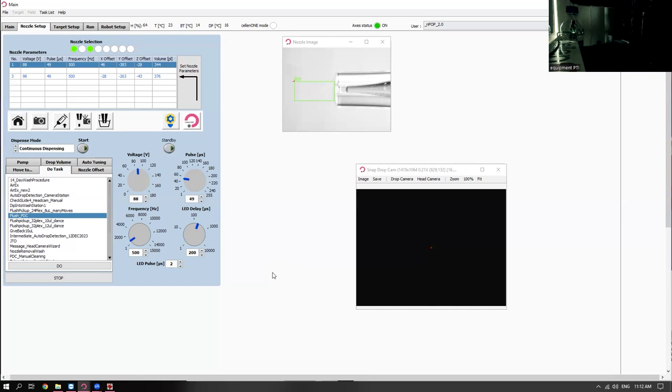Can I just make focus at it? Sure. And on the console, at the bottom of the slide, for each area it will have really a single cell droplet. Yep. And that's really helpful with the reagents. I think it's also nice to see the cells in alignment with each other.